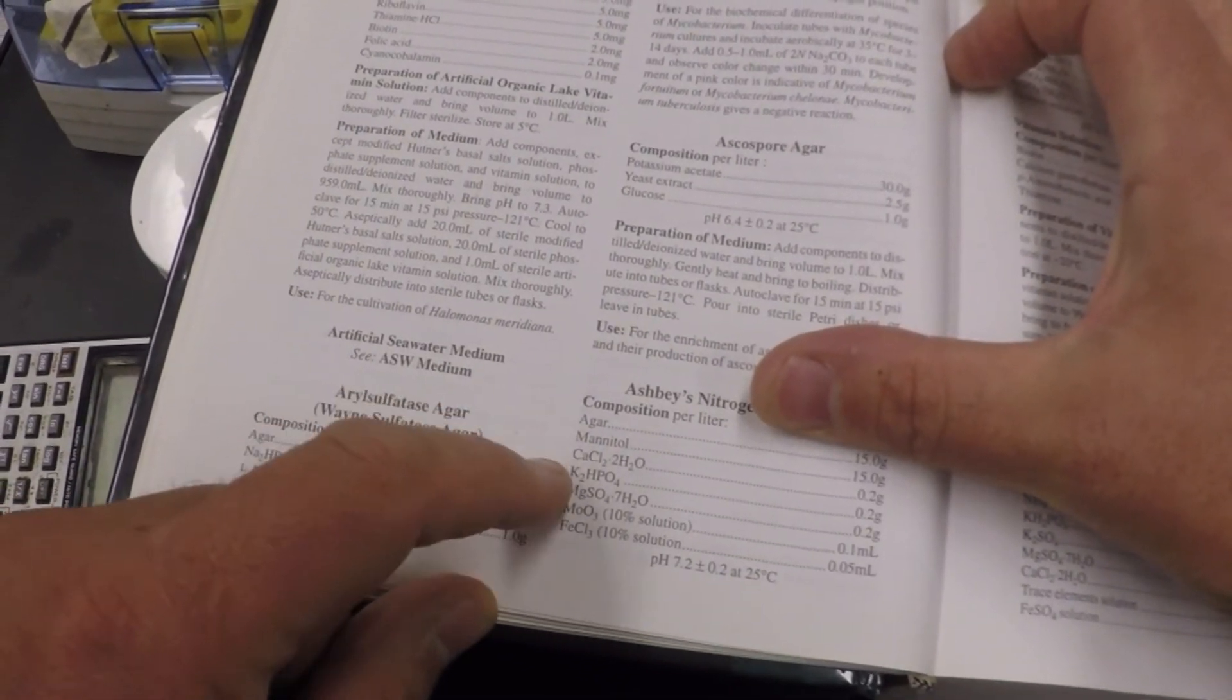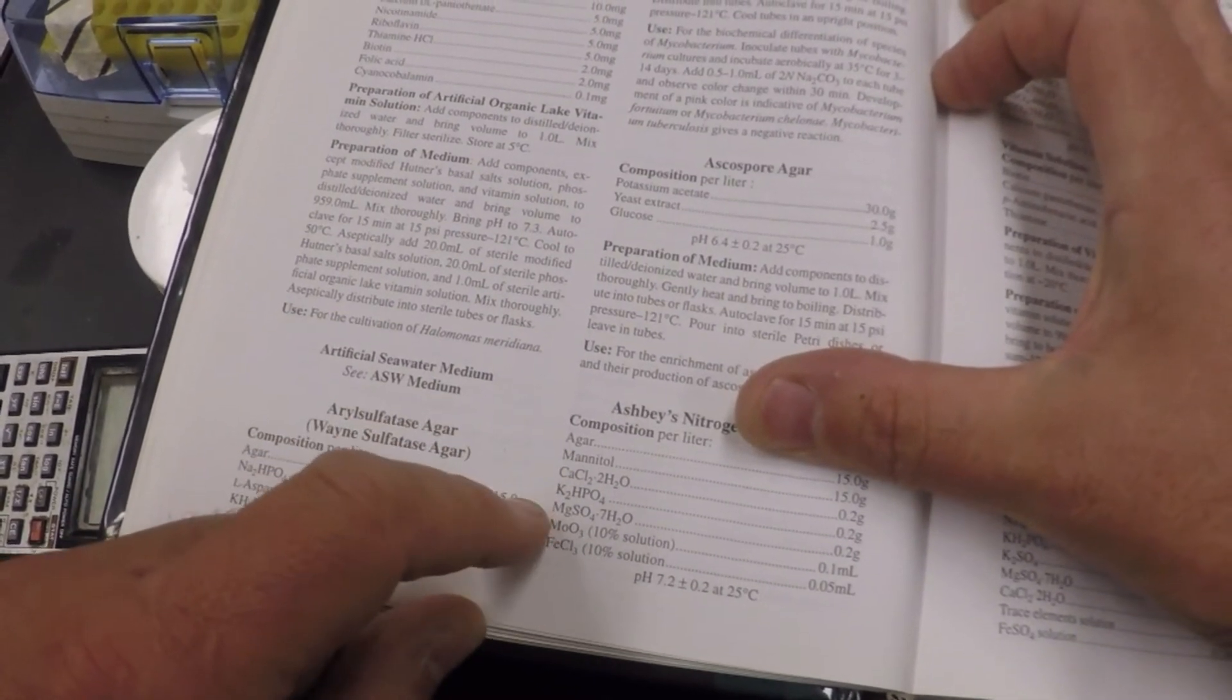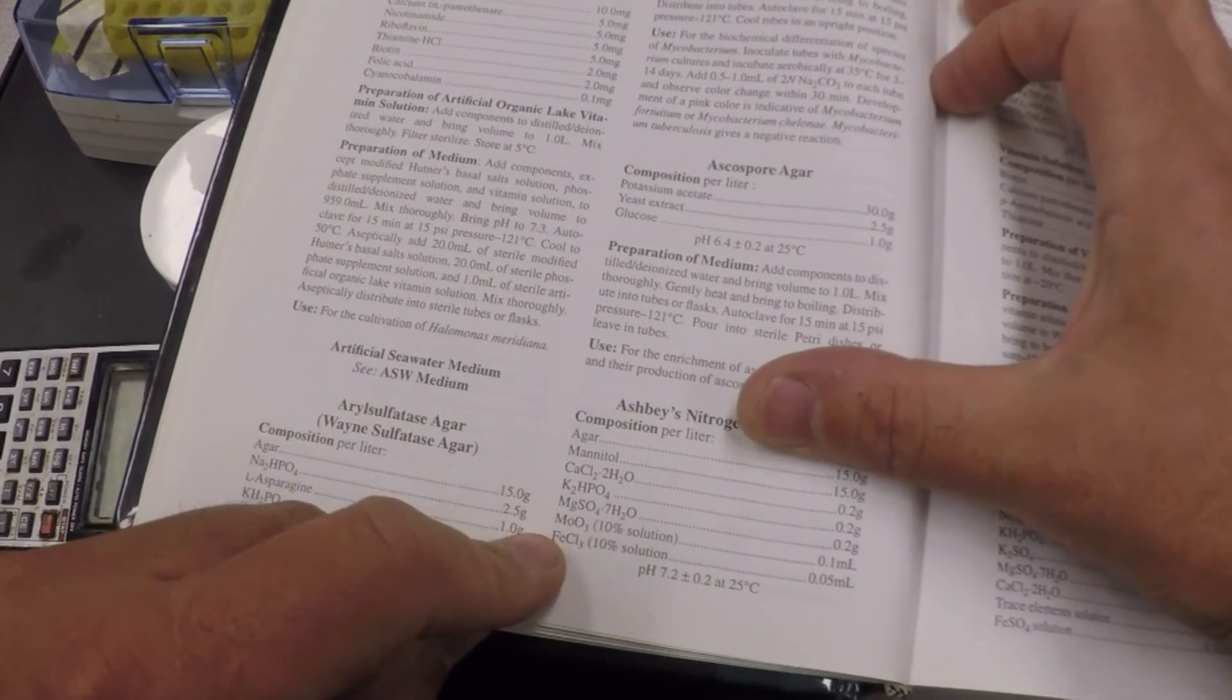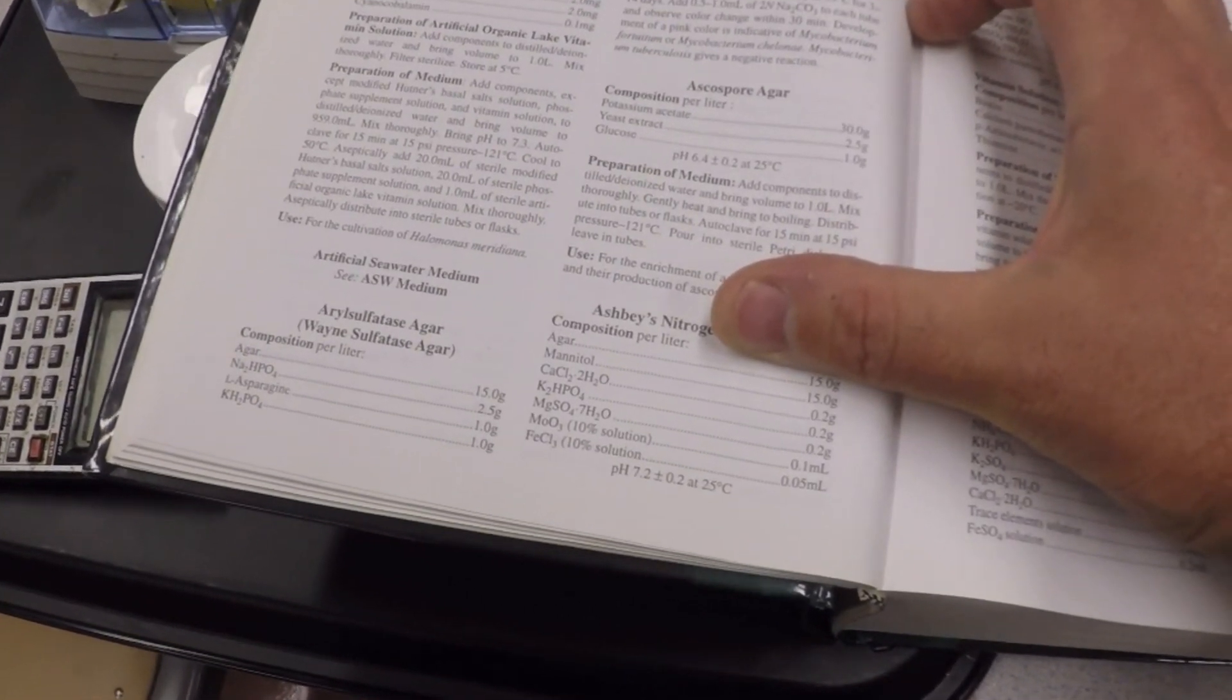calcium chloride, potassium, magnesium, molybdic stuff, iron. What is missing in that formula? What is missing in an organism that needs something?